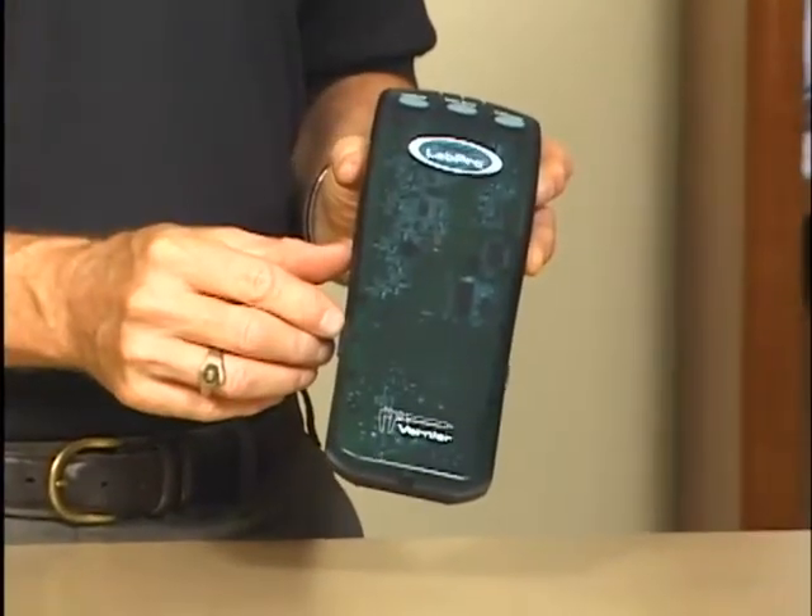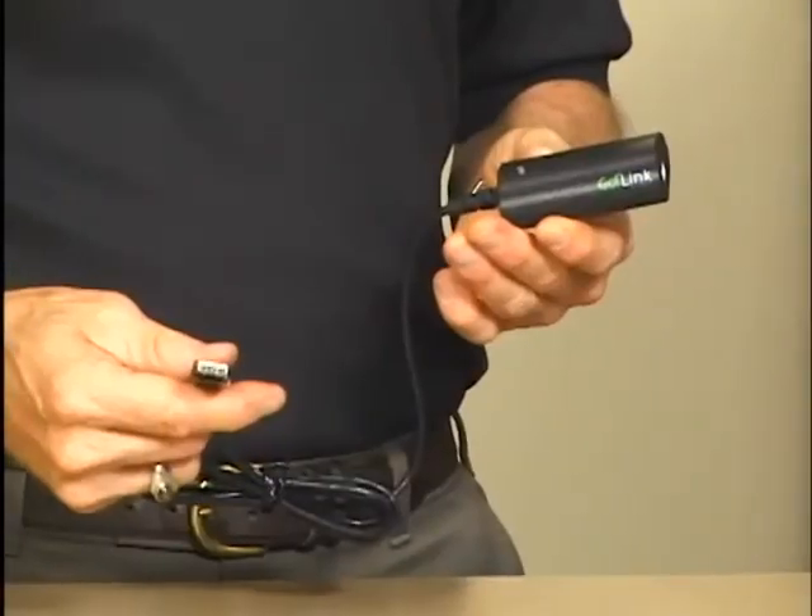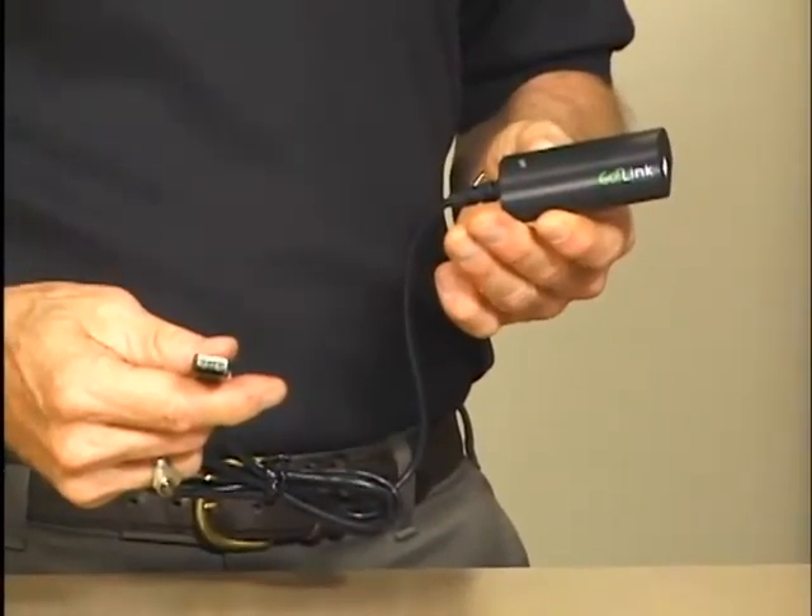We have cradles that we provide so you can put a TI graphing calculator on top and use the two together as a portable unit. Finally, we have our Golink. Golink is our real low-cost interface.